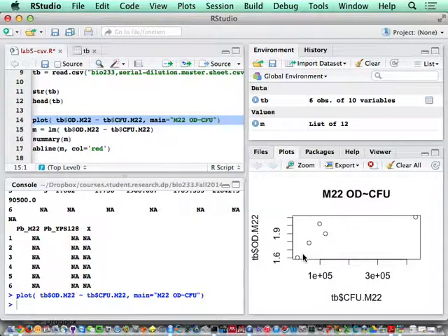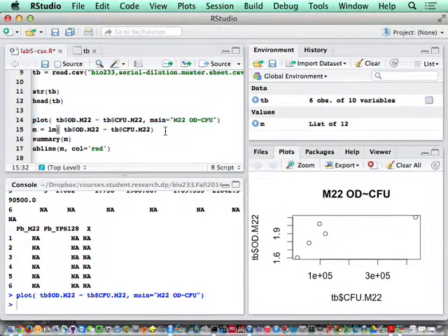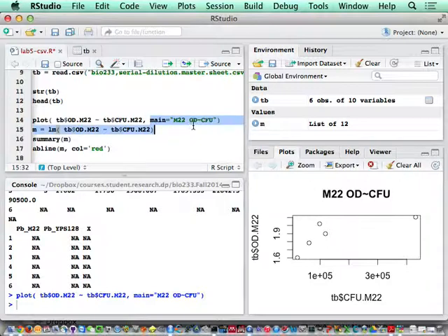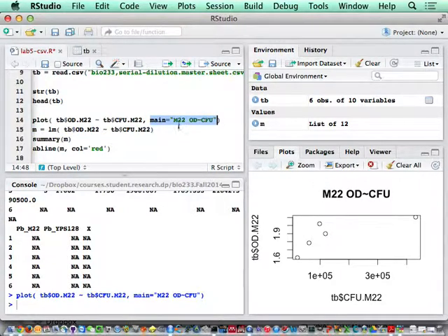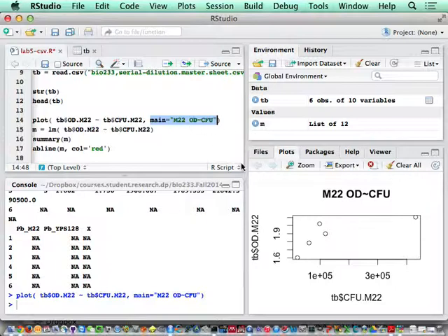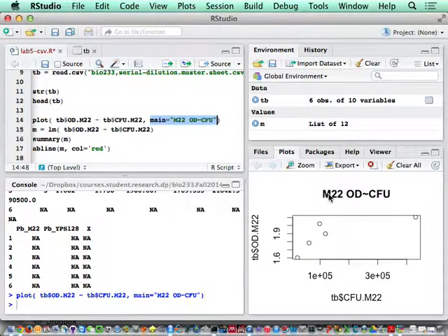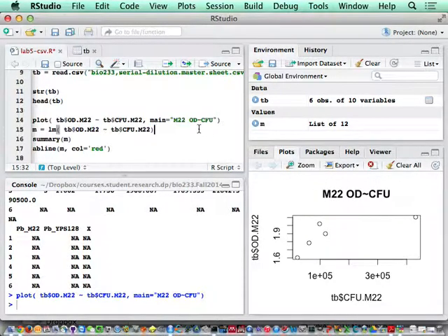The main basically gives a title to the plot. You see M22 OD versus CFU on the right-hand side. Now you see the title there. This basically gives the title to it.